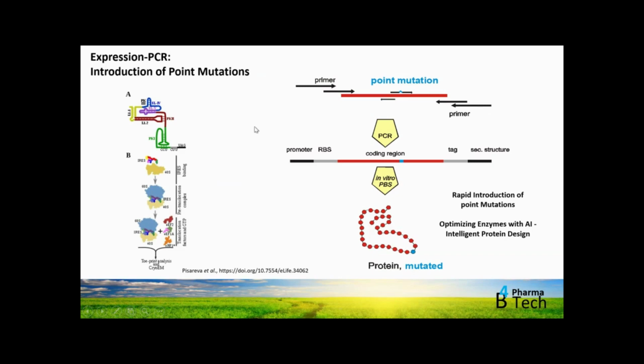So what type of DNA is added to the gene of interest? As depicted here on the left-hand side, we add an internal ribosome entry site. This is the internal ribosome entry site of the cricket paralysis virus, which is an IRES site that does not depend on any other factors. So it's a factor-independent IRES site mimicking a tRNA, which ensures the initiation of protein synthesis on the ribosome. Therefore, we do not need any cap component by using this typical IRES site. Capped messenger RNA may also be used in eukaryotic cell-free systems.